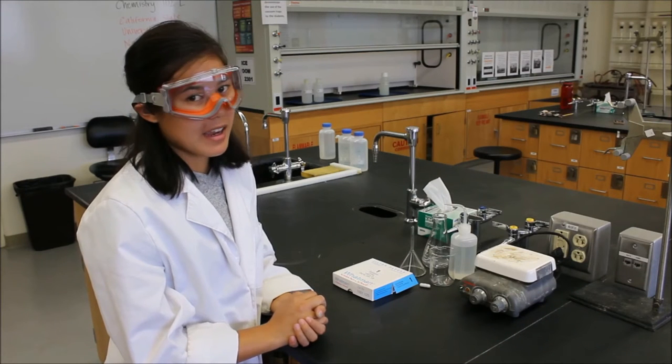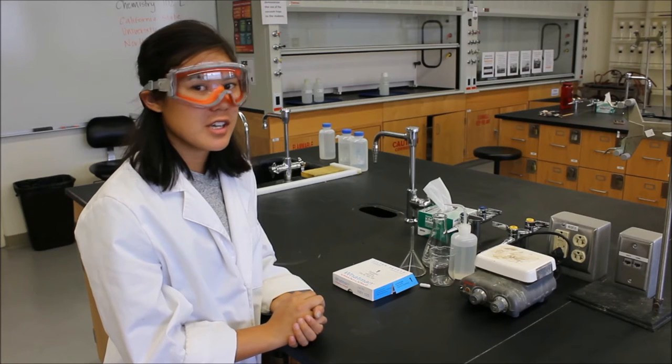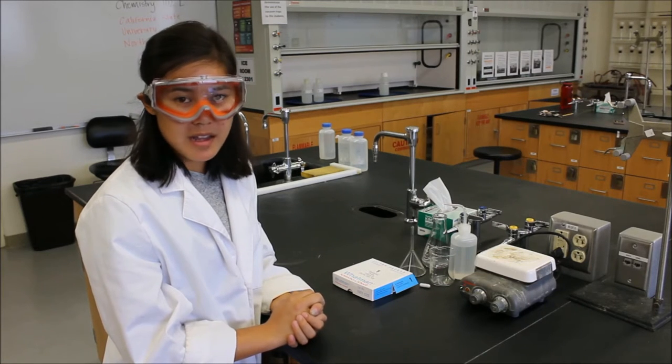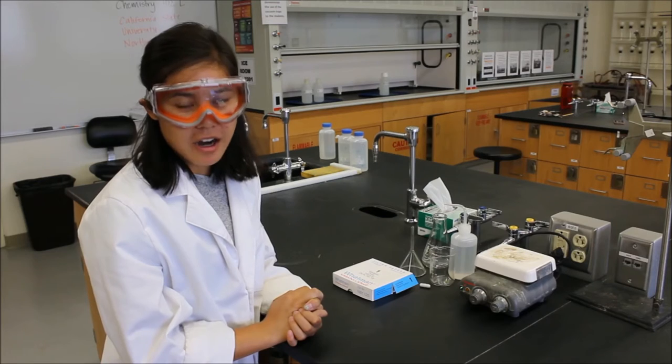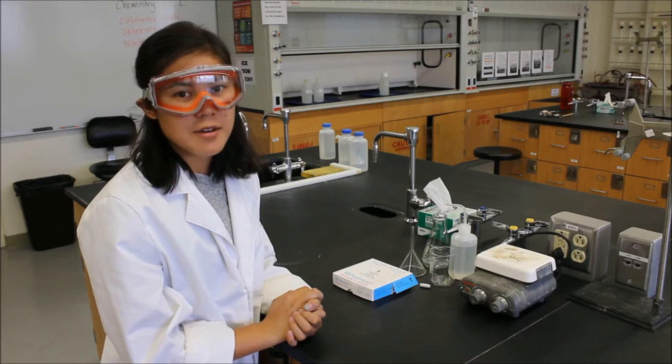Welcome back to Chem 102 Lab at California State University Northridge. Today we'll be looking at experiment one, making iron and copper complexes with oxalate.